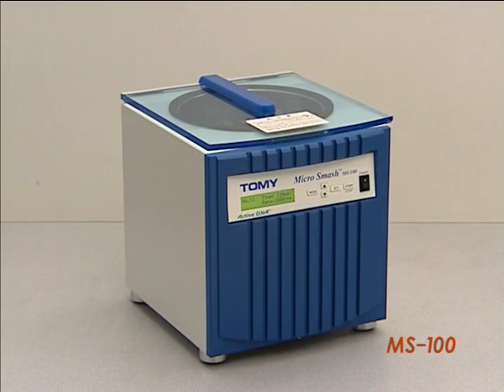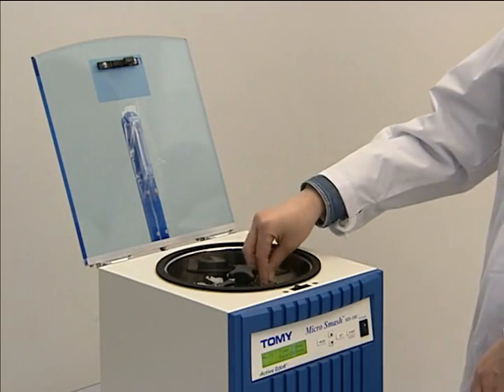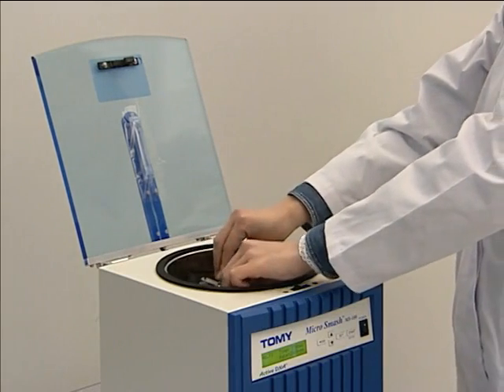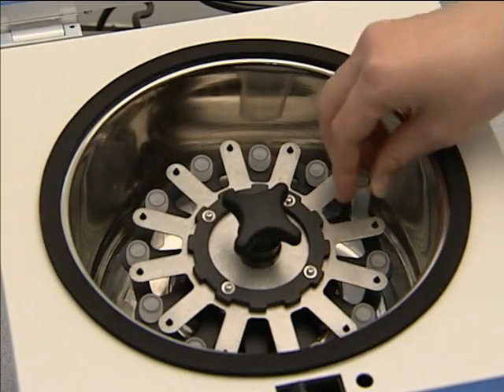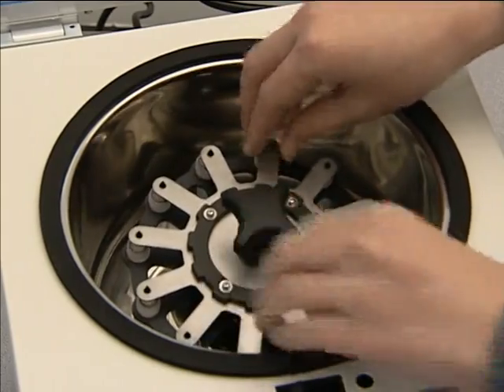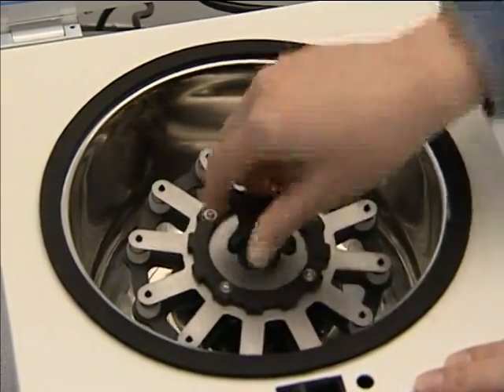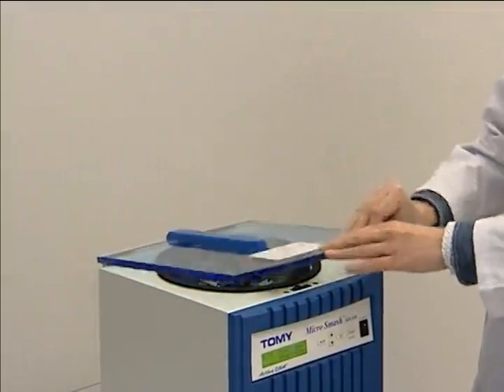The MicroSmash MS100 is also suitable for bacteria, animal, and plant tissues. Sample tubes can be easily loaded — just place the tubes into the tube holder and fix them.